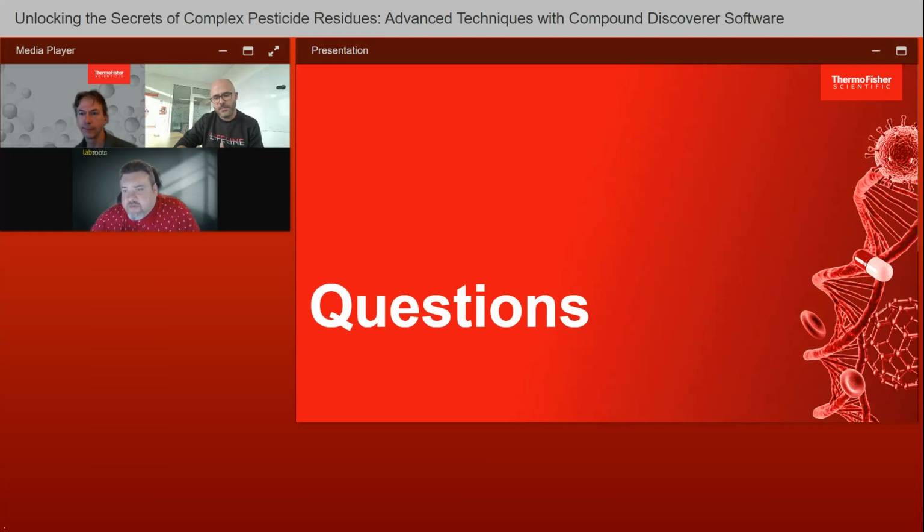Ralf, what is the difference between using the detect internal standards node and using the mass list search node with internal standards? That's a great question. So these two work in very different ways. When you're searching a mass list, this will basically work on top of the untargeted detection, right? You get your compounds table, and then searching a mass list will provide an additional layer of information for this compounds table. The detect internal standards node works very differently.